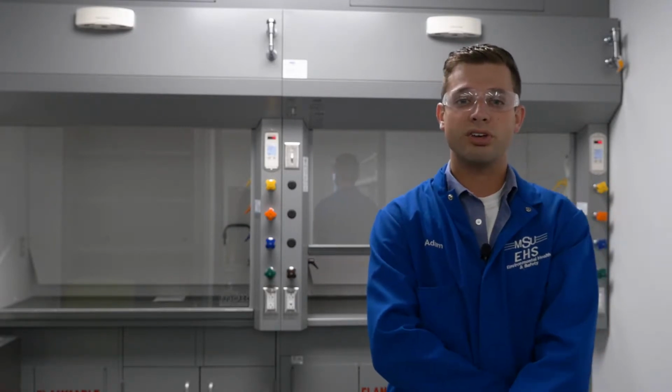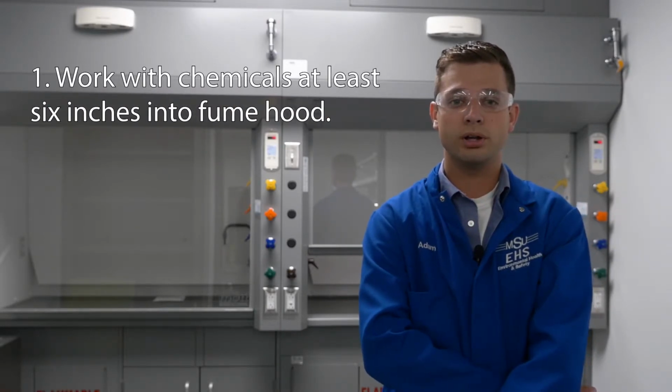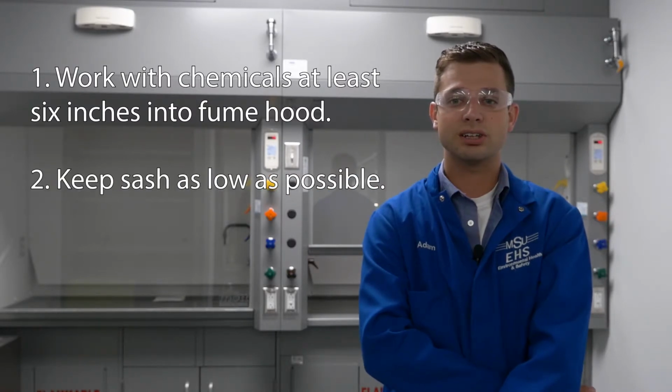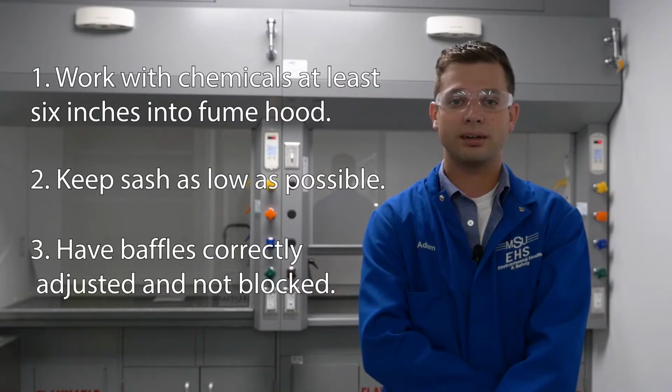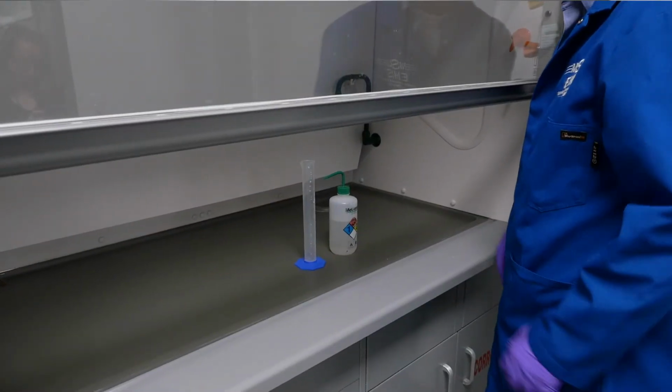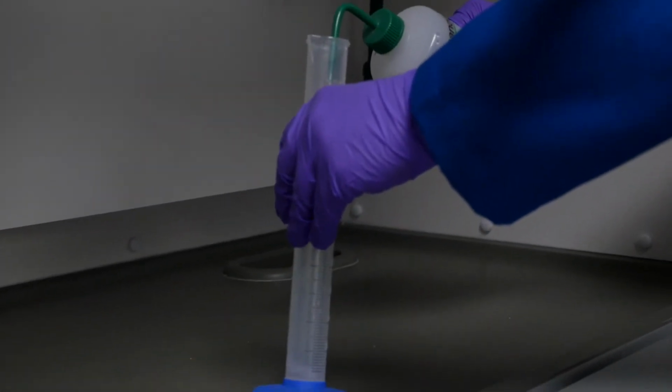It is also important to have safe operating procedures when working in fume hoods. Some key ideas to follow are: 1. Work with chemicals at least 6 inches into the fume hood. 2. Keep sash as low as possible. And 3. Have baffles correctly adjusted and not blocked. You have to work far enough back in the fume hood to make sure vapors and fumes are drawn away from you. 6 inches or more is about right. This also will keep chemicals contained if you have a spill in the hood.